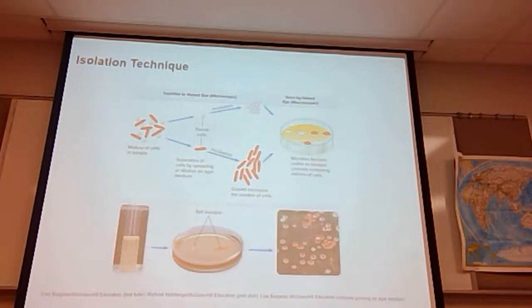For the isolation technique, you're going to take a mixture of bacterial samples. You're going to get said sample onto your inoculating loop. Hopefully, through this process over here, which you see the streaks going back and forth, that is referred to as a streak plate. Hopefully, while you're doing that, you will separate these cells into discrete one-cell units. You have a single white parent cell there, a single elongated red parent cell there, and you have all the progeny here, and you wind up with these two colonies that are now visible to the naked eye. Therefore, they are now macroscopic.